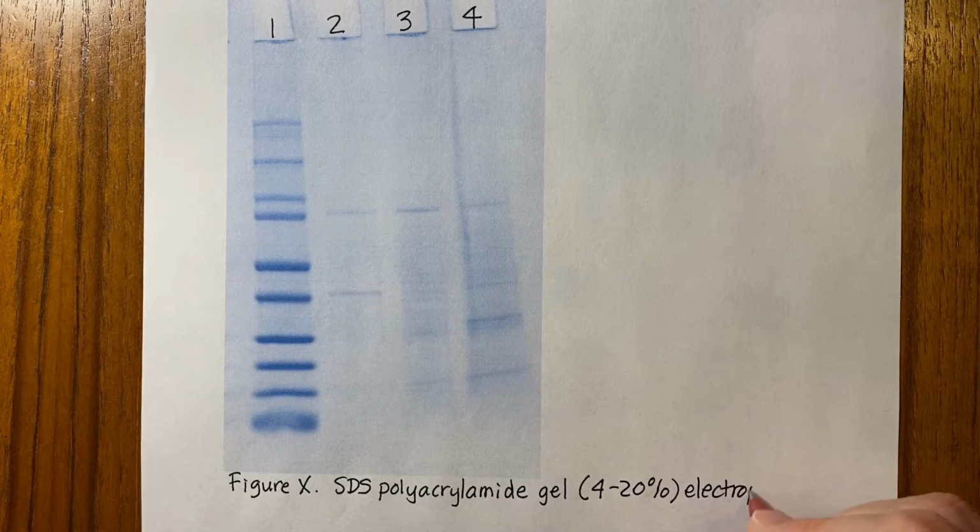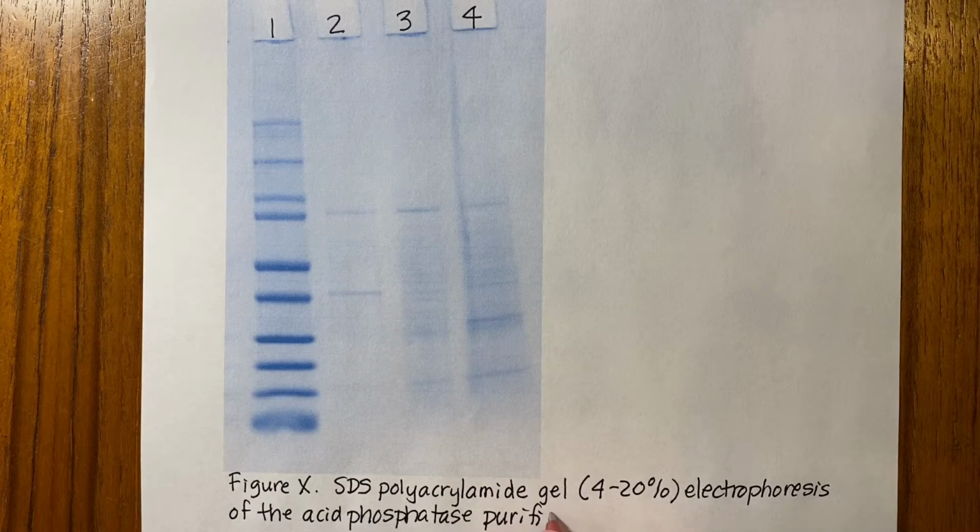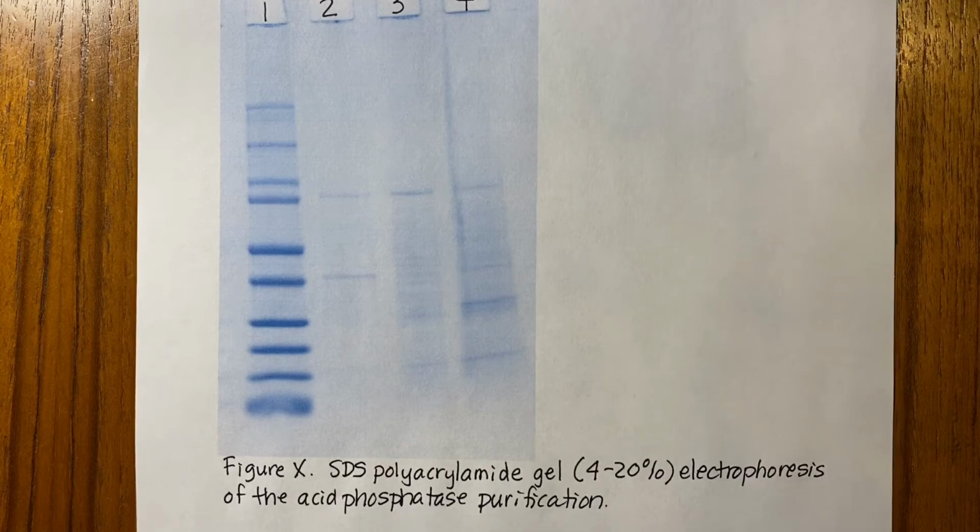Electrophoresis of the acid phosphatase purification. So that's a suitable title. Then you need to identify what the lanes are.